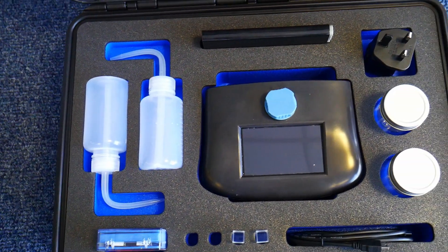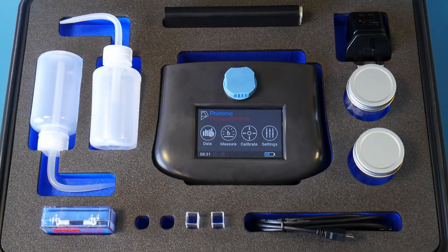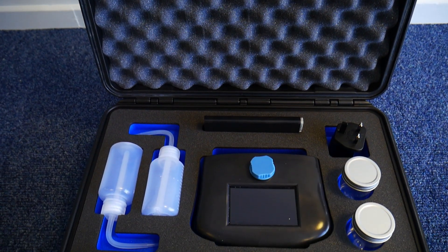Included in the GO case is two sample dispensers, one charger, one battery bank, one box of cuvettes, two sample containers, and one USB cable for exporting data.